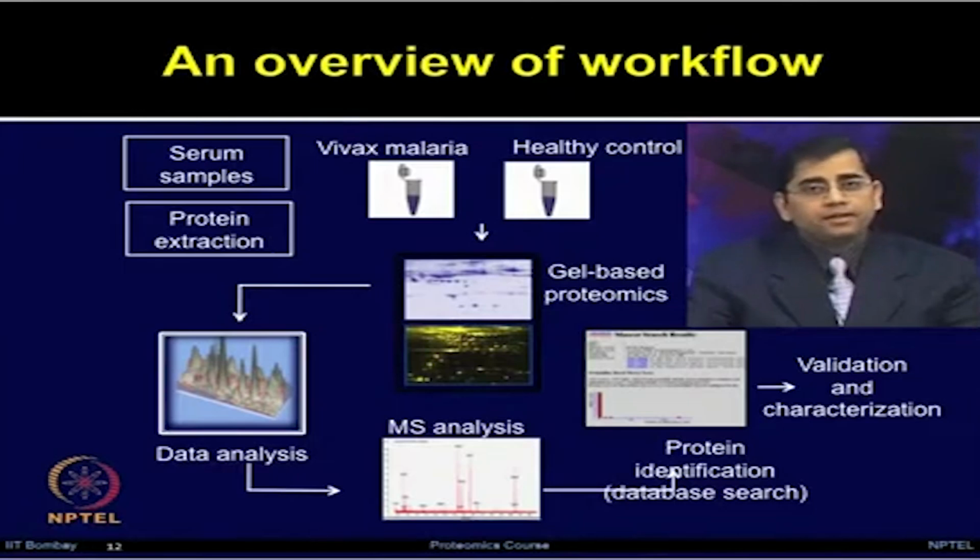We separated a large number of proteins on the gels, compared the data, looked for proteins significantly differentially expressed in vivax as compared to the healthy controls, and then subjected those proteins to mass spectrometry analysis.